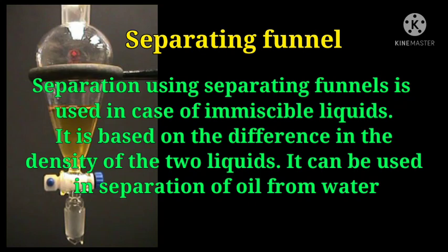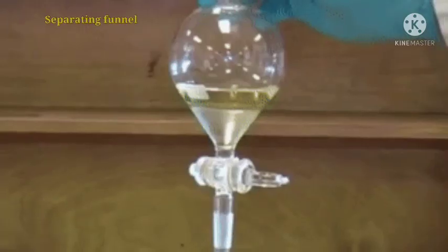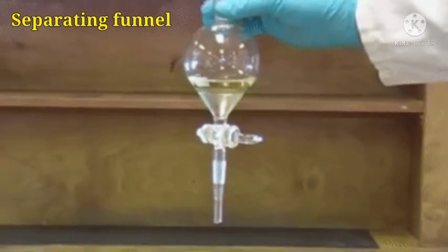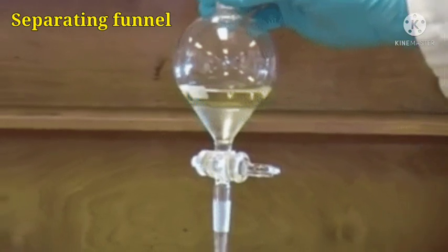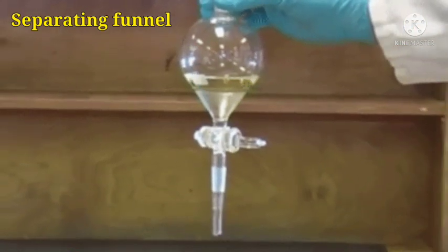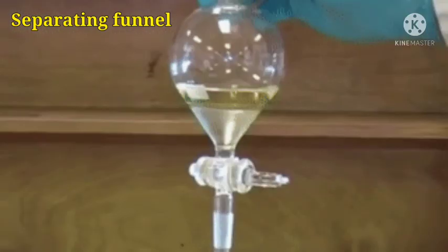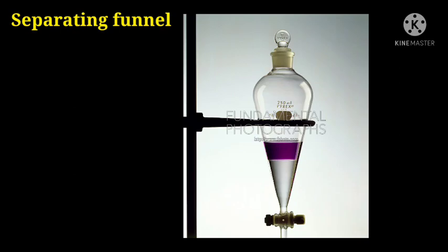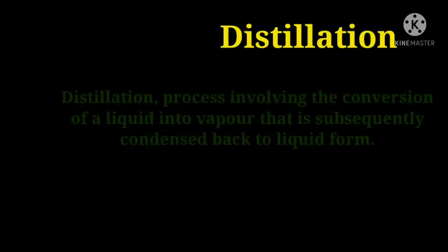And a separating funnel can be used in the separation of oil from water. We know that oil has less density compared to water. That's why oil always floats over the water. And you can see in the separating funnel very clearly, oil has less density, that's why it floats over the water. And with the help of the separating funnel, by opening the nozzle at the tip of the funnel, you can see at the bottom, we can separate the water from the oil.